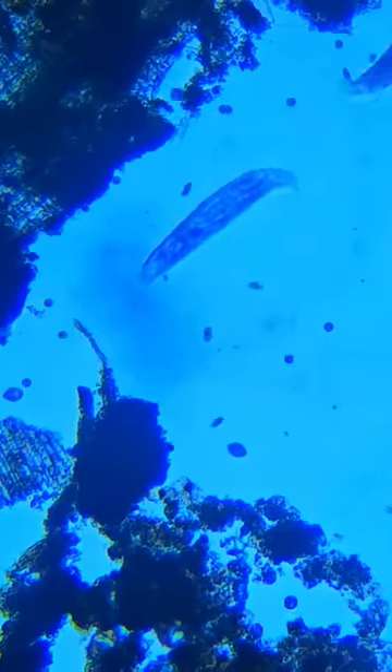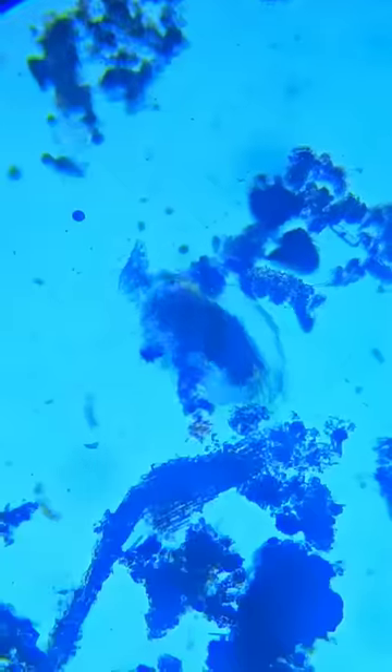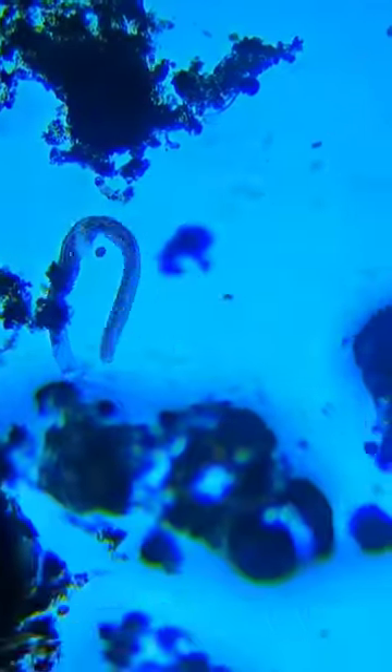I'm not a microbiologist, so I don't know the names of a lot of these things. But what I do know is there's some pretty nasty looking creatures living in this pond water — a lot of stuff I certainly don't want to drink.